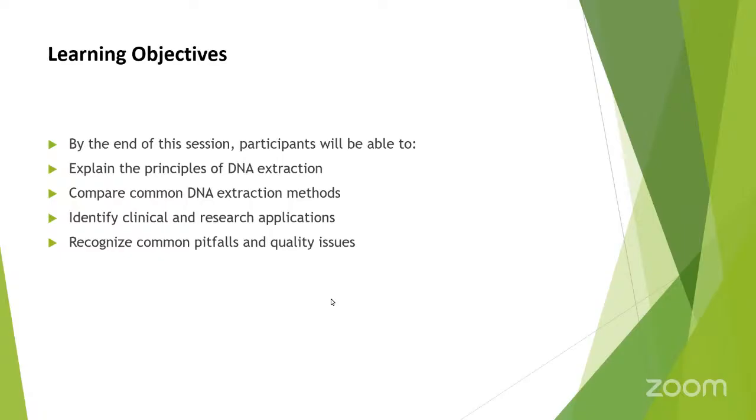by the end of this session, participants will be able to explain the principles of DNA extraction, compare the common DNA extraction methods, identify clinical and research applications, recognize common pitfalls and quality issues.